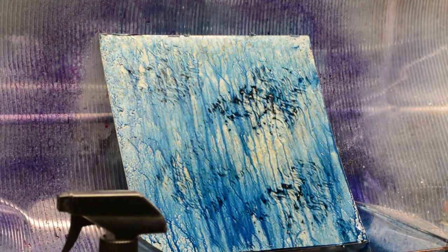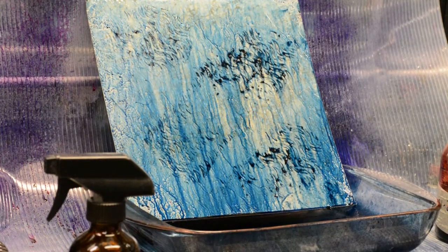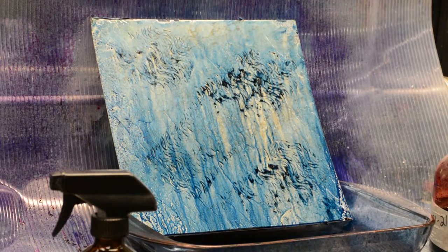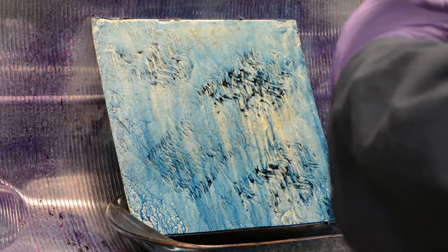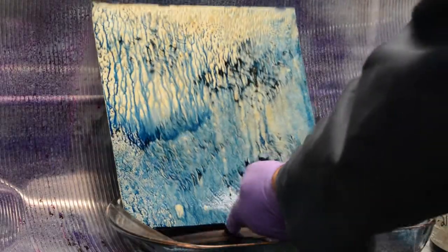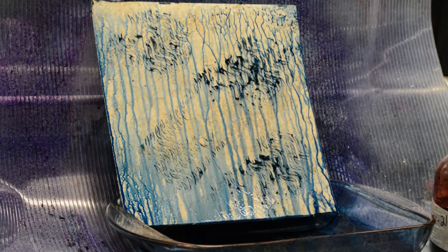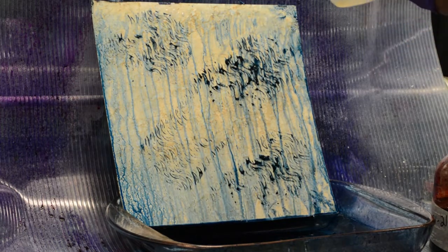Let that sit for a moment. You can already see some enhancement there. That darker tint is showing through the rinse, or through the excess that's on there, the runoff. Spray on our fixative now. And the final step is adding the distilled water.